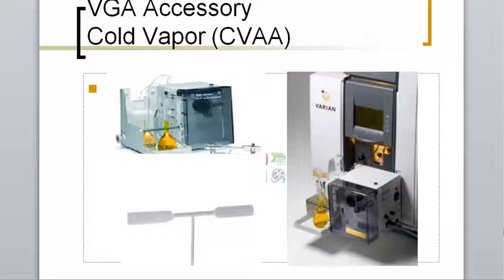Back here behind the bar, you see a couple of other containers. Here's another volumetric flask, and behind that volumetric flask, it might be hard to see, but there is a white, clear, opaque-looking jug with a screw cap, and this also contains a solution. They just give you an idea of what can be used for this. So there's two solutions back here.